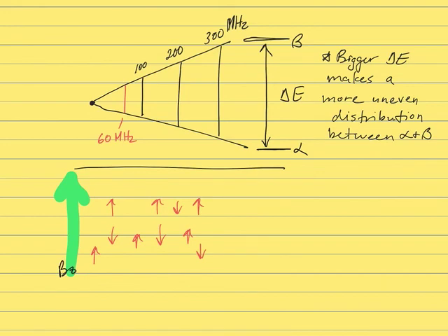As these line up with and against the magnetic field, we're also going to form an internal magnetic field, which I'm going to call M sub Z. So this is going to be the net magnetic field of our sample.